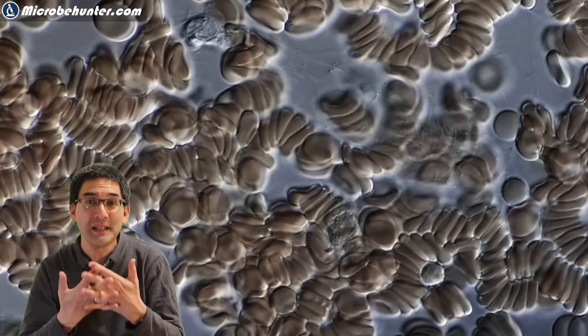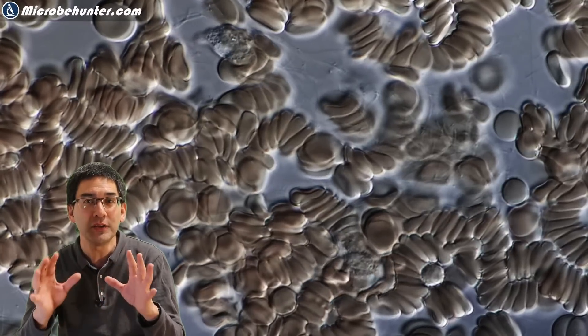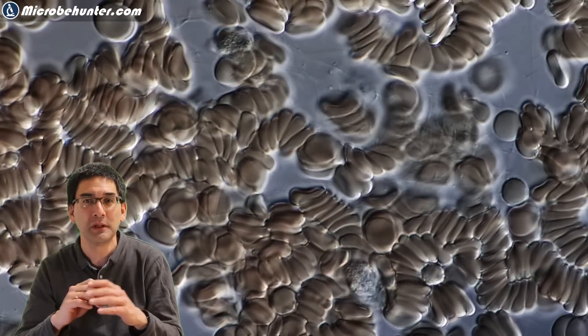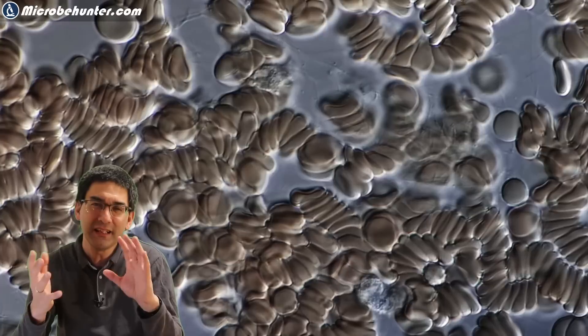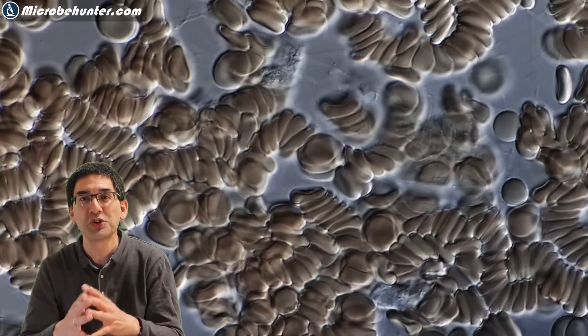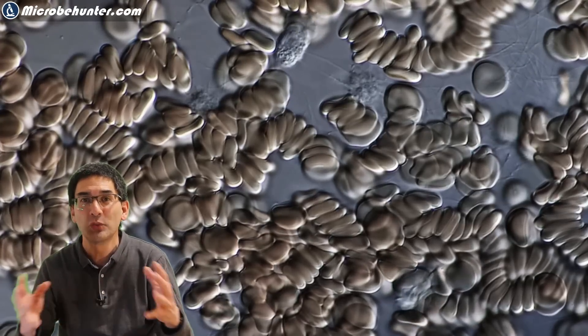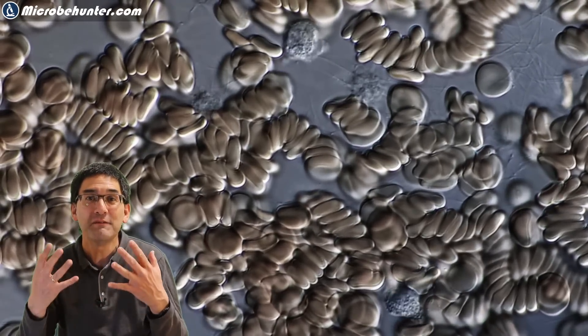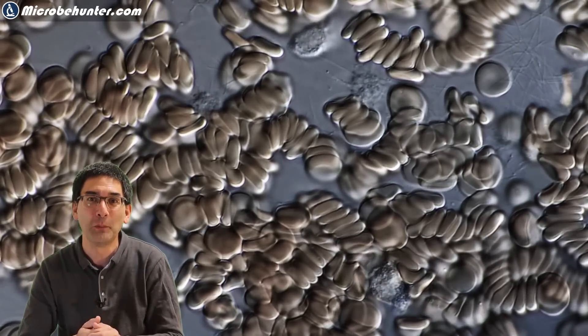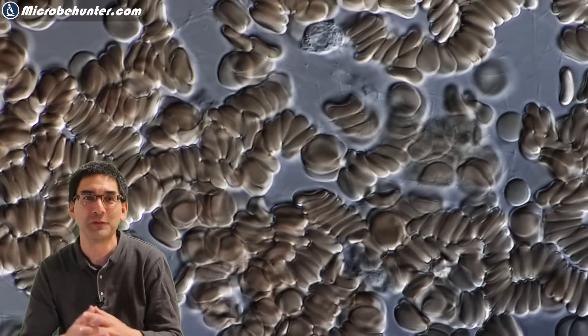It is also quite interesting to see other structures inside the blood, like very tiny fibers. I think they could be blood clots and also some other stationary cells. So we see that the blood is indeed a very complex mixture of different cells and different substances.